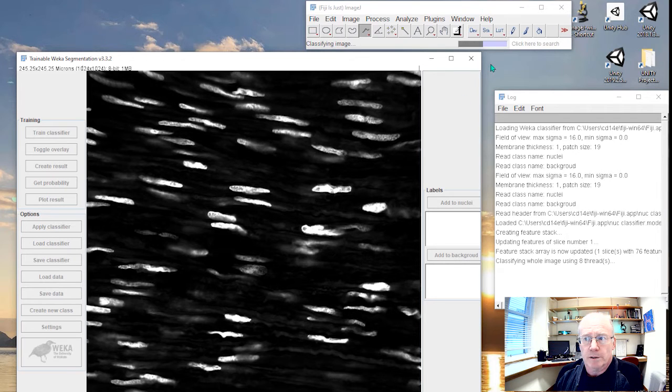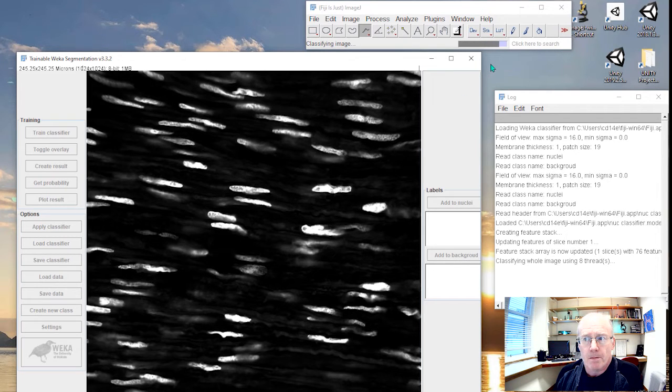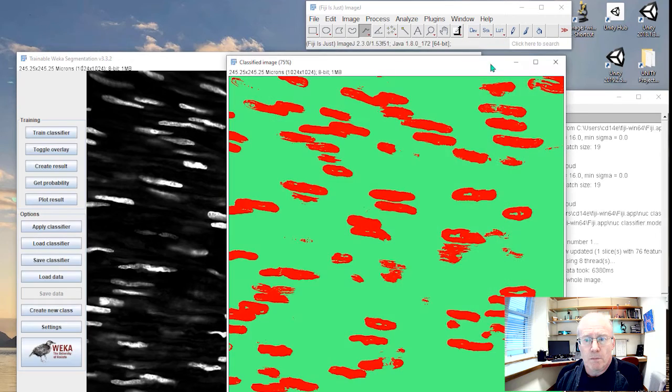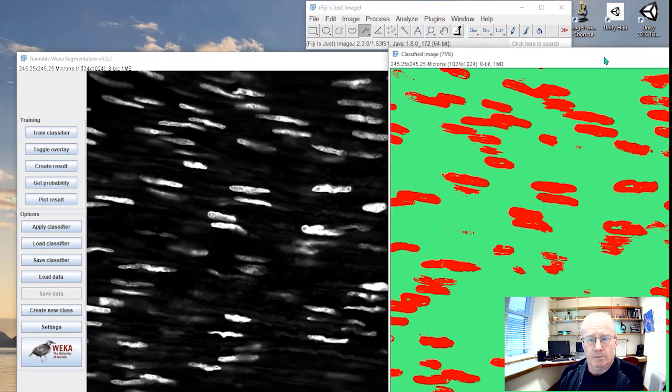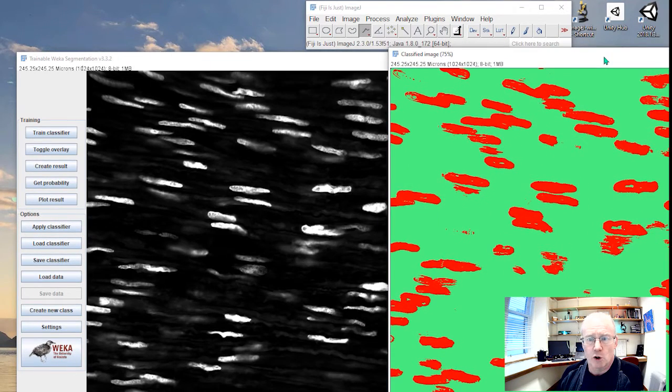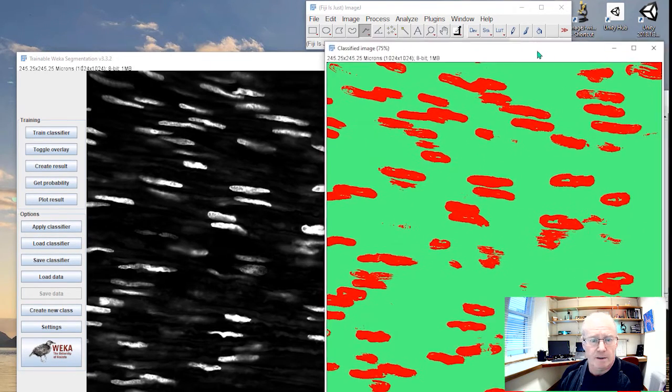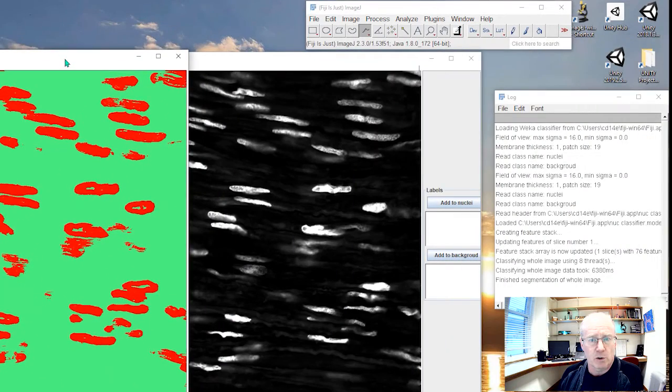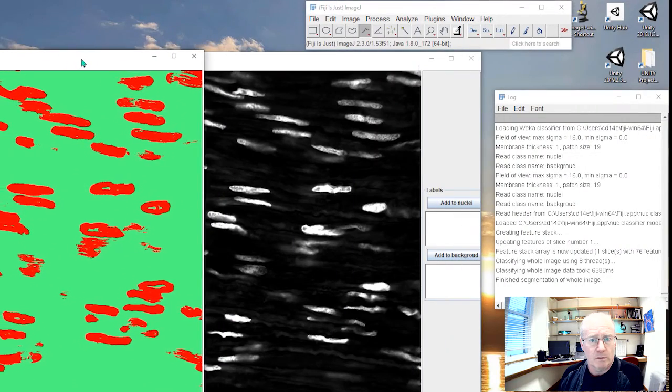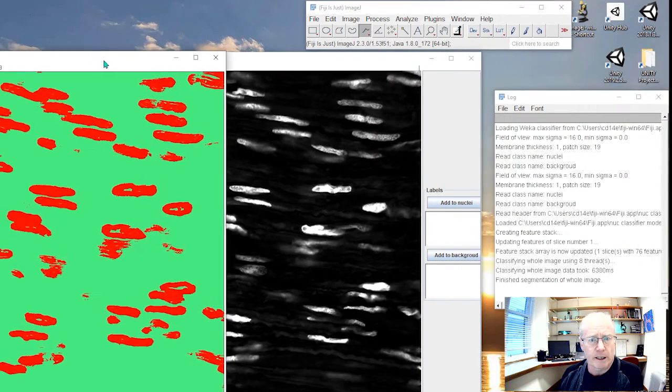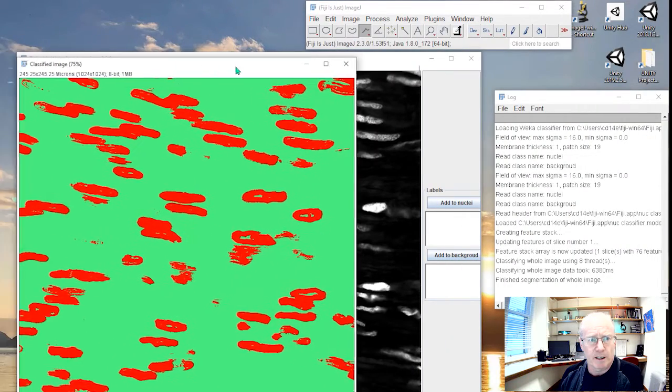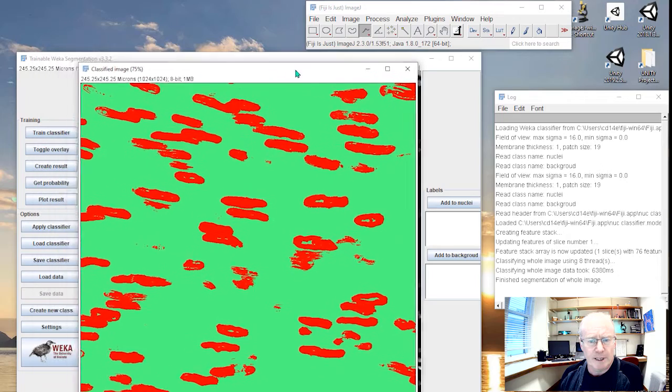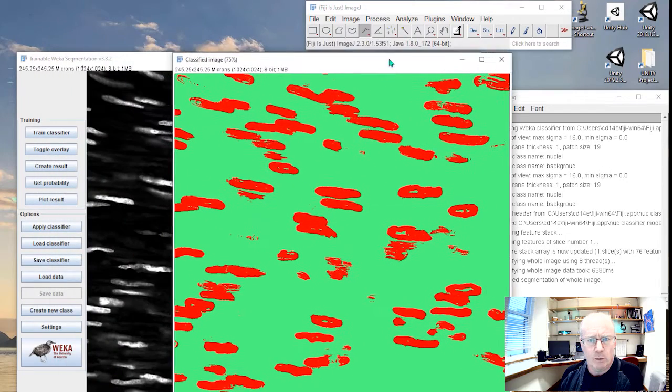Here it comes. There you go. Well, it's not too bad as a first go. Maybe the nuclei are a little bit big. A bit bigger than I had hoped for.